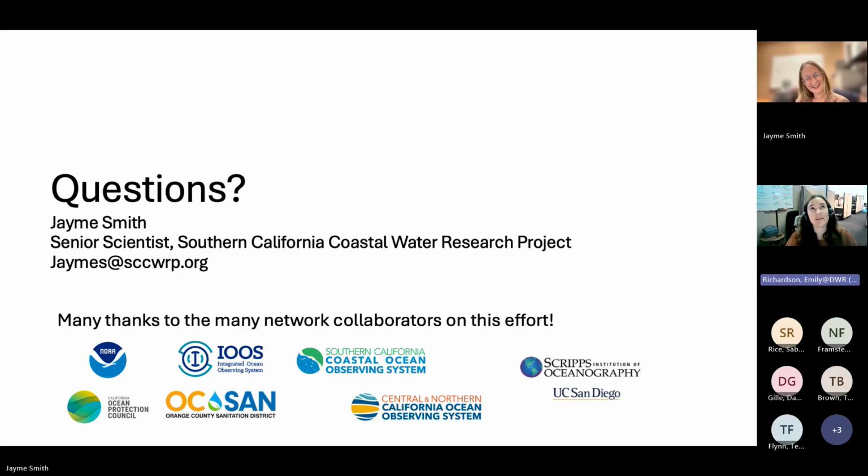Let's see. So if we were to do discrete sampling back at a lab, would you need to preserve it, like put some Lugol's in the sample, or how would that interfere with the pictures and IDs?